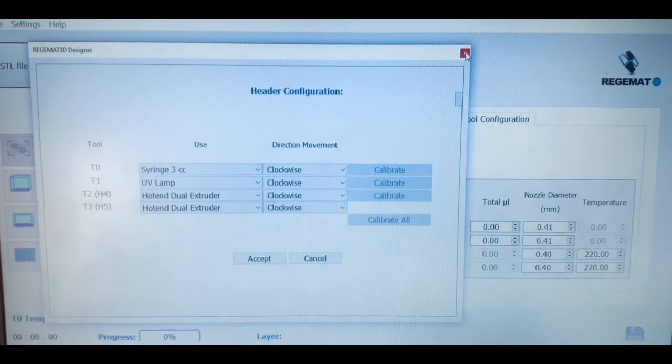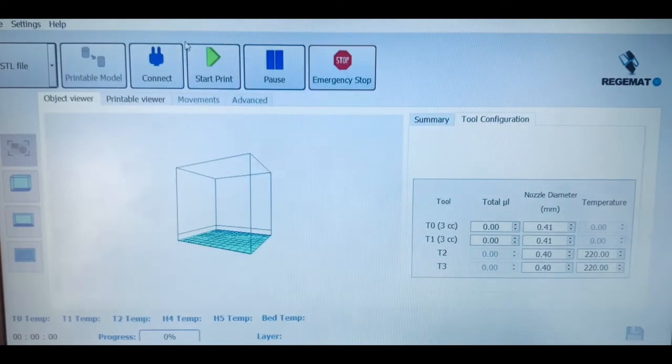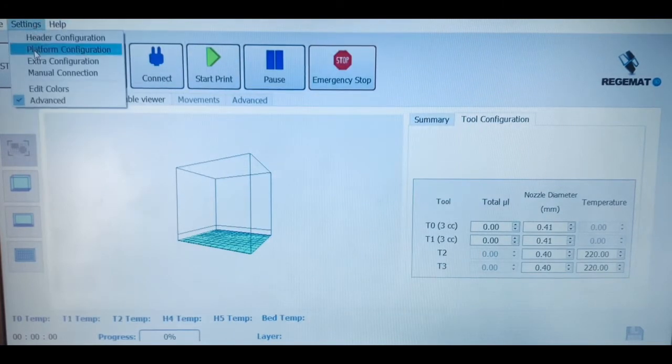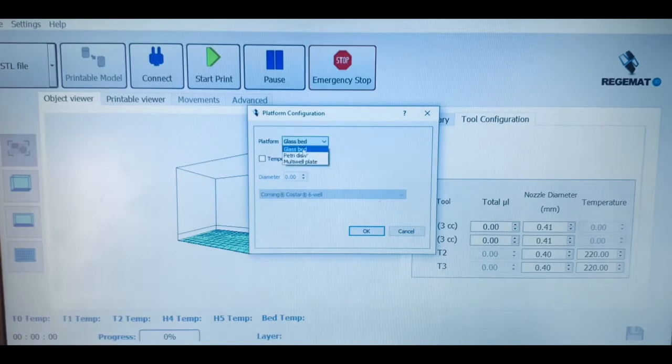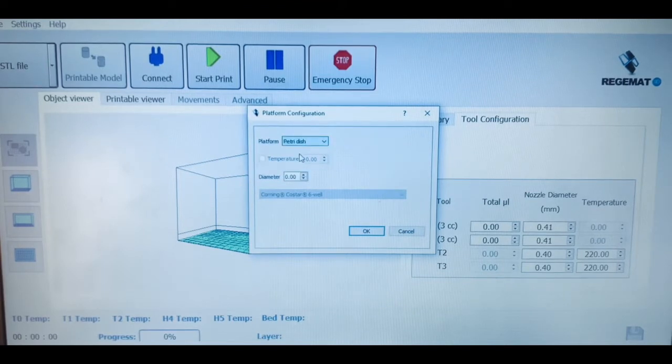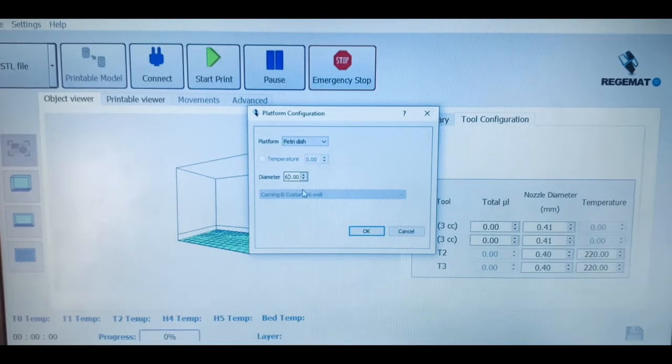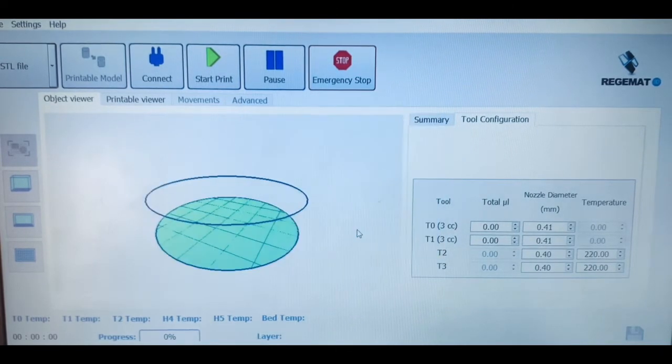And then we can go and select the printing platform in which we will culture our biological constructs. Here we have all formats available, from regular petri dishes to brand-specific multi-well plates, including from 6 to 96 well formats.